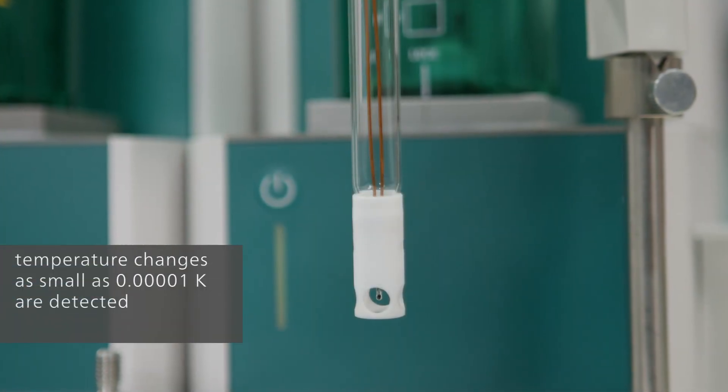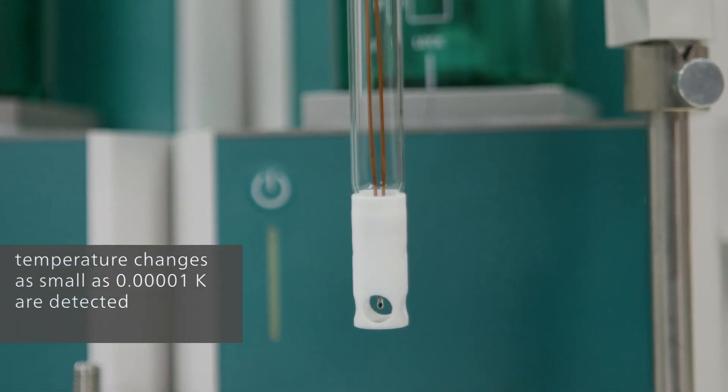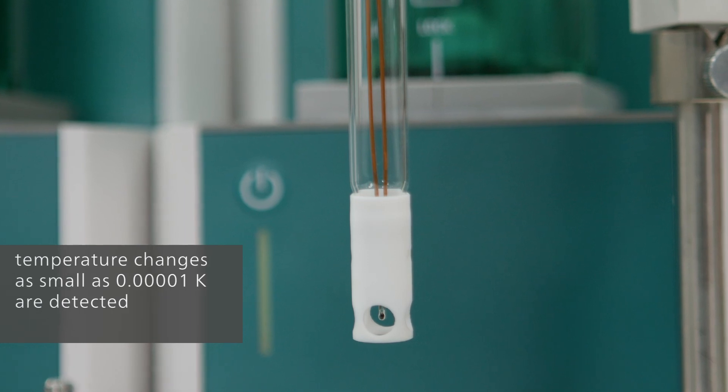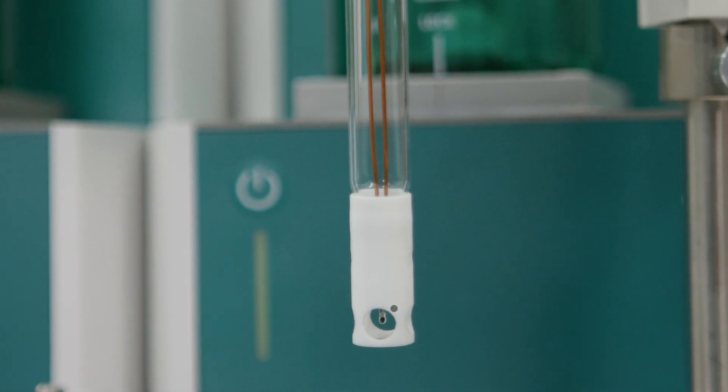Temperature changes as small as 0.00001 Kelvin can be measured with a Metrohm D-thermoprobe. This ensures extremely reliable endpoint detection.